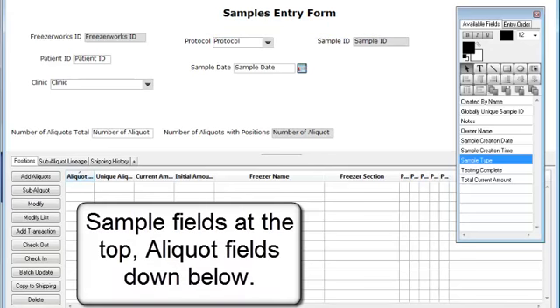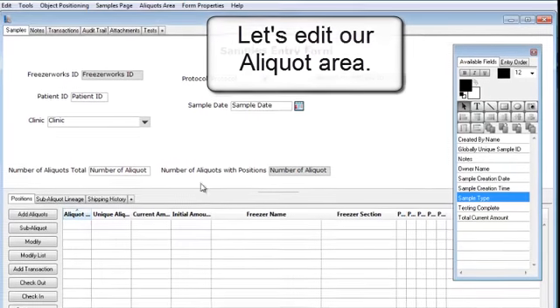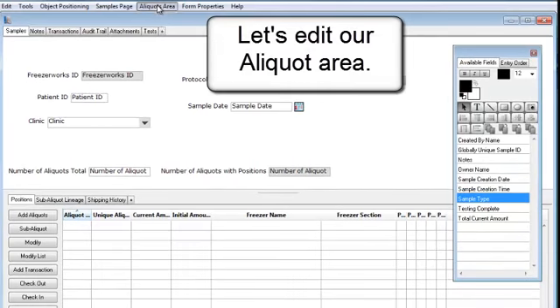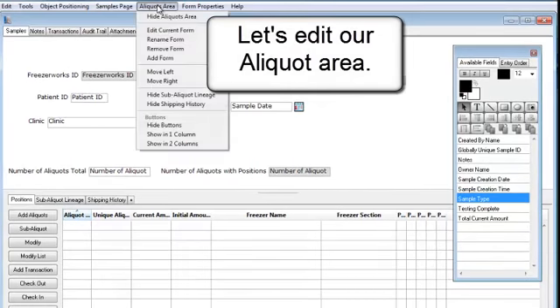Sample fields at the top, aliquot fields down below. Let's edit our aliquot area.